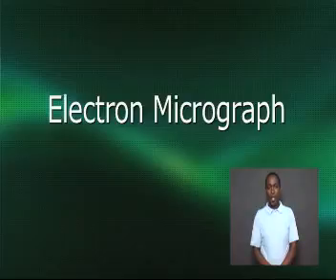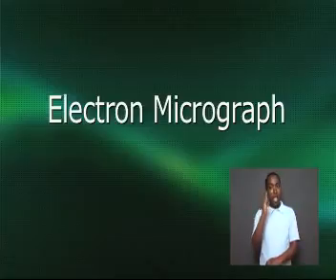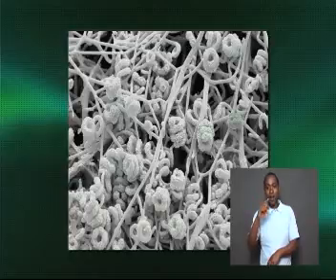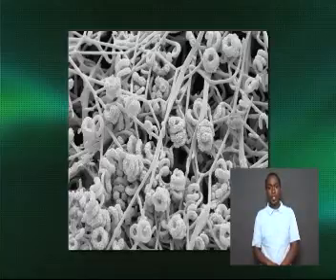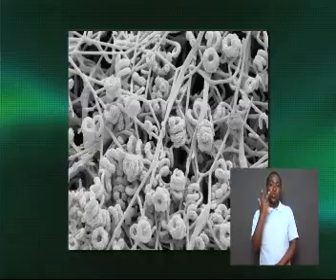Electronics attached to the microscope produce the image on a television screen. The image can be saved as a photograph called an electron micrograph. Electron micrographs show the surface of the cells. They also show the details of the structure, allow for a greater depth of focus, and provide a three-dimensional view of the specimen.